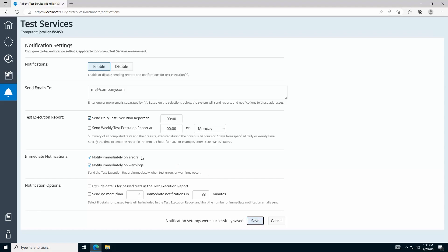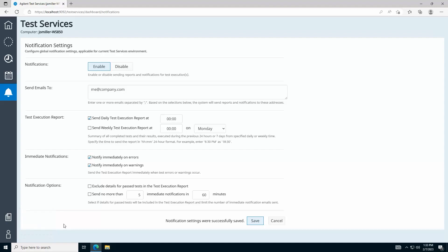Lastly, at the bottom of the navigation pane, you can find documentation on Test Services and a button to log out of Test Services.